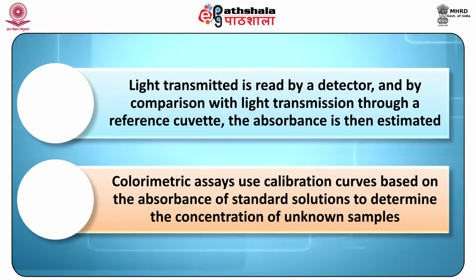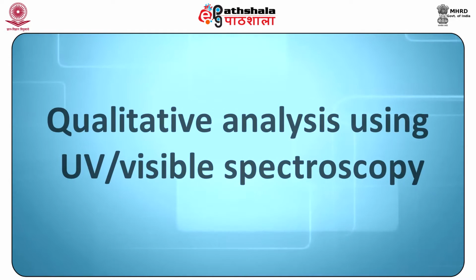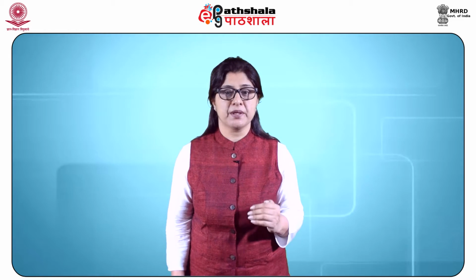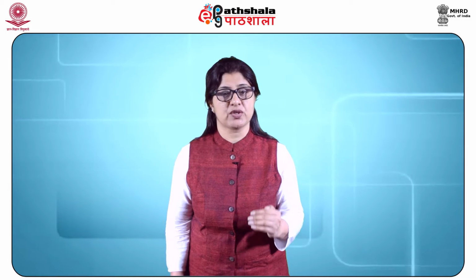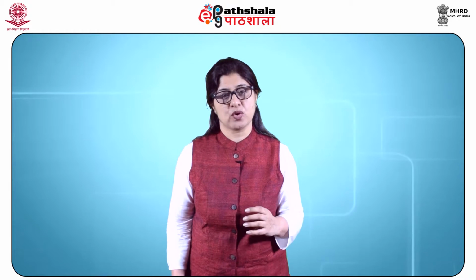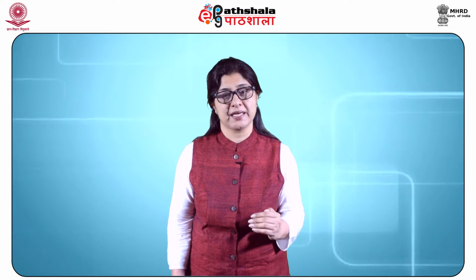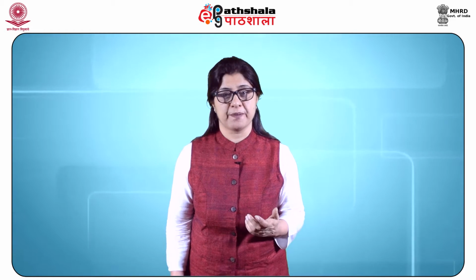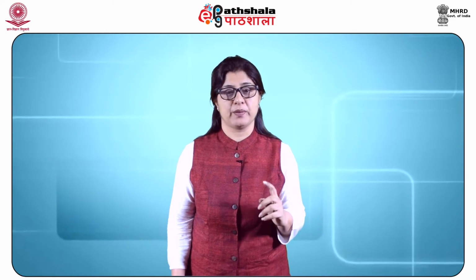Colorimetric assays use calibration curves based on the absorbance of the standard solutions to determine the concentration of the unknown samples. Qualitative analysis using UV visible spectroscopy. UV visible spectroscopy provides a limited amount of qualitative information, as spectra generally consist of only a few broad absorbance bands as compared with other techniques such as infrared spectroscopy or NMR spectroscopy, which produce many narrow bands.